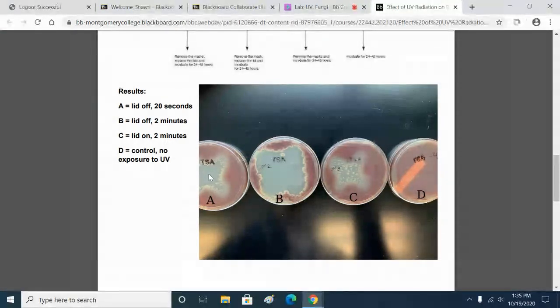Now, what about the paper? Did the paper protect the bacteria from UV? Yes, it did, right? But you can't wear paper sunglasses, because then you can't see anything. So again, we've shown that UV kills even with short exposure times, although longer is better.